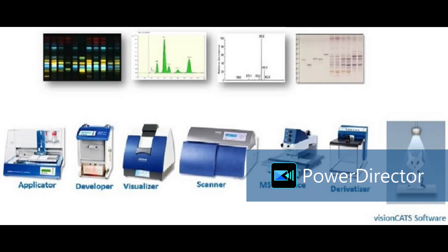After application I will go for development, or if I want to see how the bands are applied, I will go for visualization. Suppose initially I want to check whether it has a chromophore, whether it is visible in UV light or fluorescent light. I will take an image after application also. So we can utilize all these modules simultaneously. There is no hard and fast rule that you have to follow this sequence. For R&D it is very good, and for complex samples it is very good.